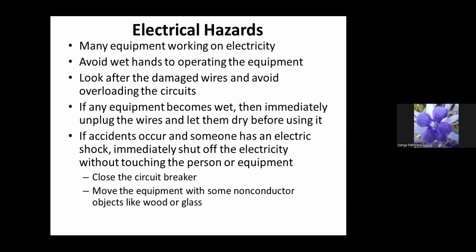When we consider electrical hazards, they can happen in a laboratory because many equipments work on electricity. So we have to avoid wet hands when operating the equipment, look after damaged wires, and avoid overloading the circuits. If any equipment becomes wet, immediately unplug the wires and let it dry before using it.